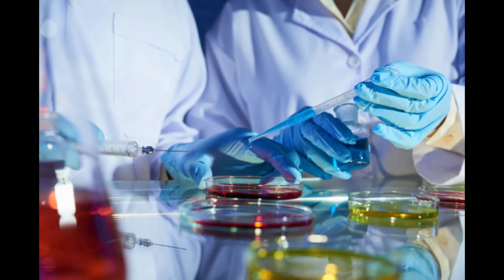But when you inoculate this, again, try not to touch the test tube, but you're going to go in here and you're going to gently set your loop down on the slant of the agar and do that zigzag and drag it across the agar and pull it back out. And that's it, you've inoculated it. So when you see growth on it, it should be in your zigzag pattern.